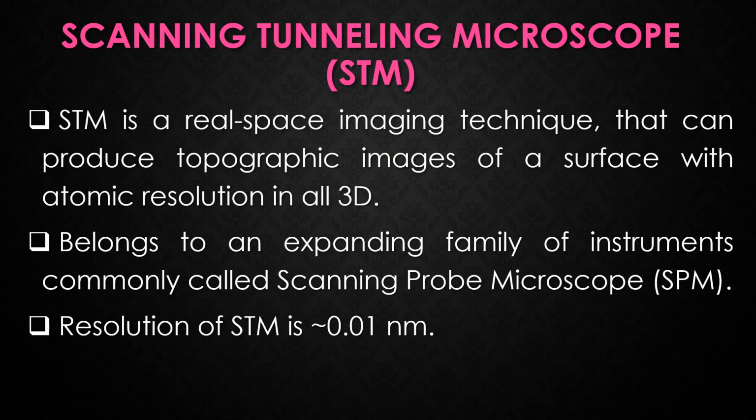The scanning tunneling microscope, STM, is a real space imaging technique that can produce topographical images of a surface with atomic resolution in all three dimensions. Scanning tunneling microscopy belongs to an expanding family of instruments which are commonly called scanning probe microscopes. The resolution of scanning tunneling microscopy is approximately 0.01 nanometer.